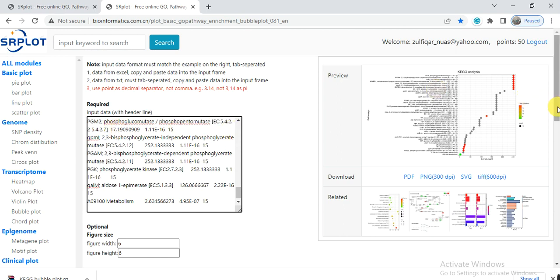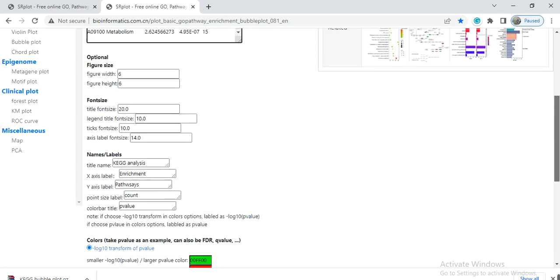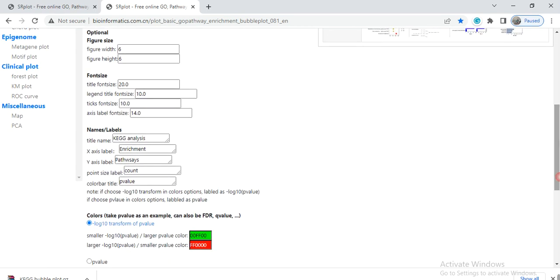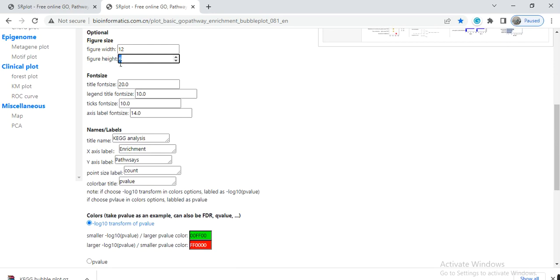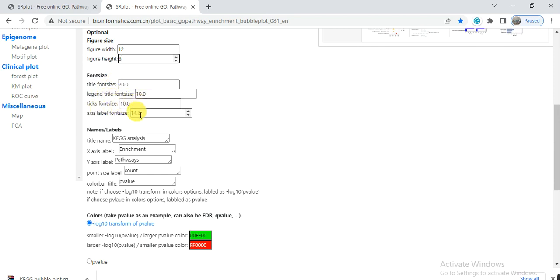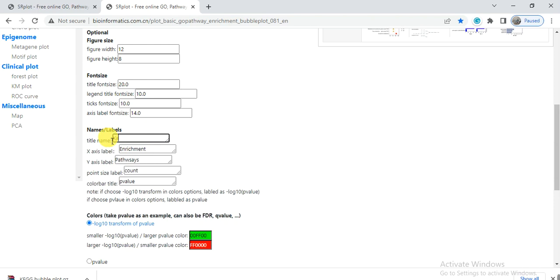Here is the required input data - paste what you recently copied from the Excel sheet. Here are some options: figure width you can increase up to 12, height maybe 8, 9, or 10. Title font size and legend title font size you can increase or keep as is.